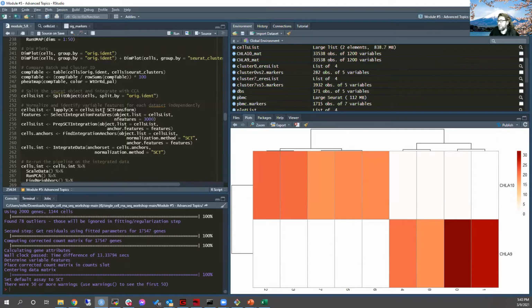All right, so we ran this. Depending on the speed at which your processor can run, it'll take anywhere from a couple seconds to a couple minutes. So if you're still running this, I'm going to give a couple seconds while I'm talking here for you to catch up. But if you're still running when I move on, just don't lose heart. There'll be plenty of time for you to catch up.